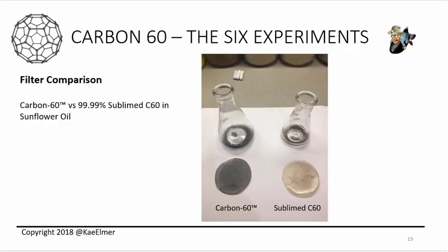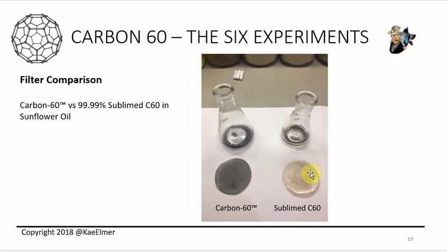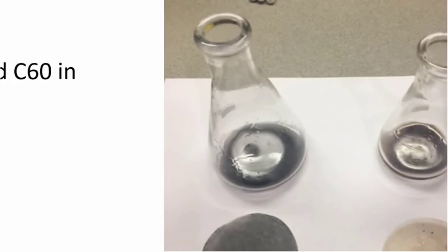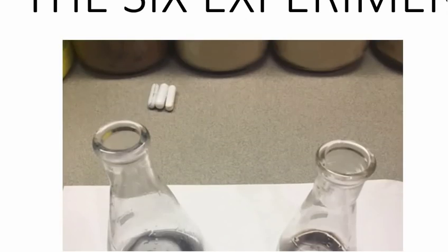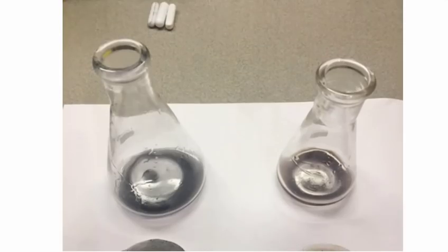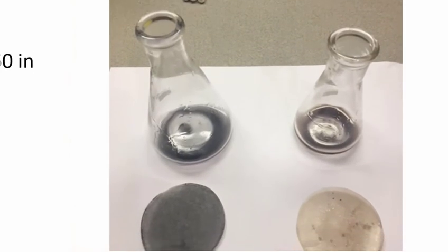And so I just want to show you too, here's the difference in the filters. When I filtered out the Carbon-60, basically the carbon came out, and then it turned into that. And then when I filtered out the Sublime C60, basically nothing came out. I'll just blow this up a little bit so you can see it a little bit closer. There we go. A little bit too big. Oh, sorry. Okay, but there you go.